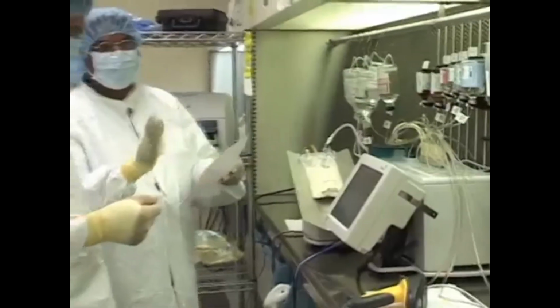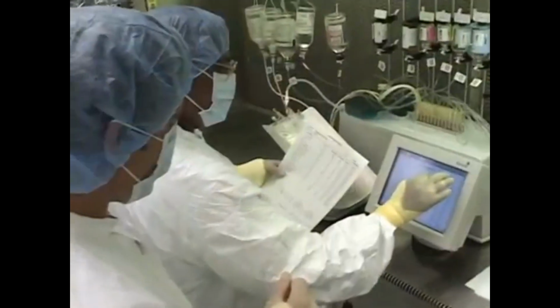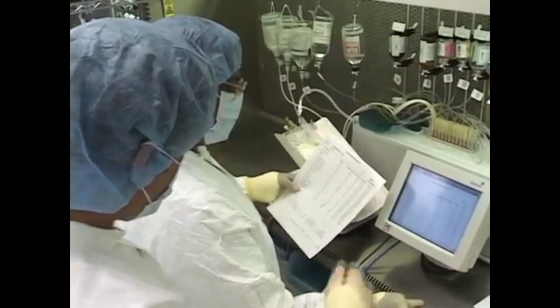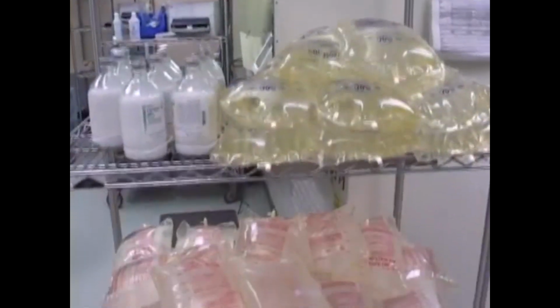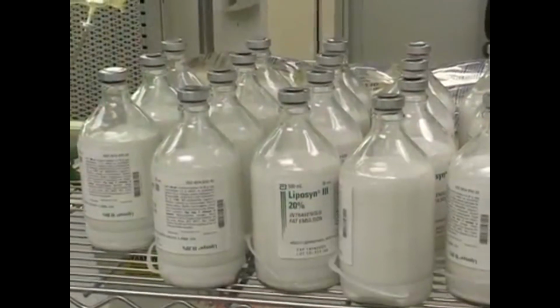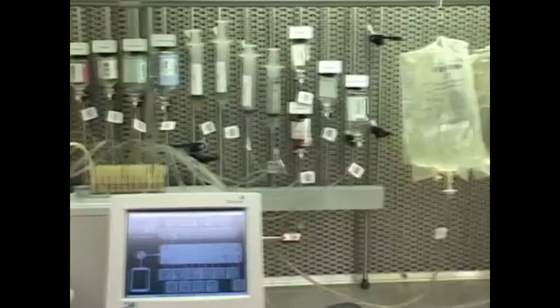In the former, 3 primary pieces of equipment are used, sometimes together and sometimes individually. For example, one computer-controlled ACD prepares the base components, dextrose, amino acids, and possibly fat emulsion and water, while a second networked ACD adds most or all of the additives or other components.